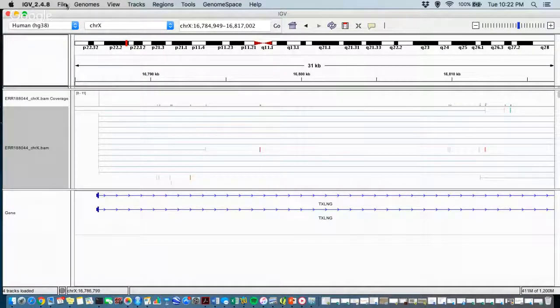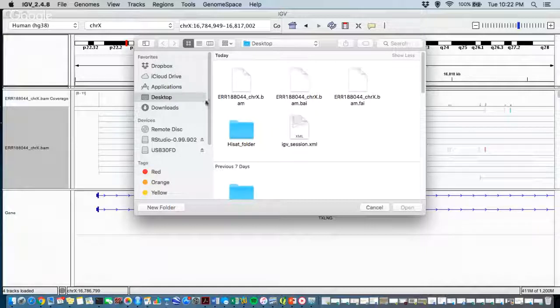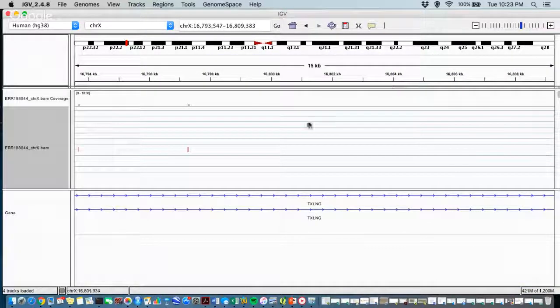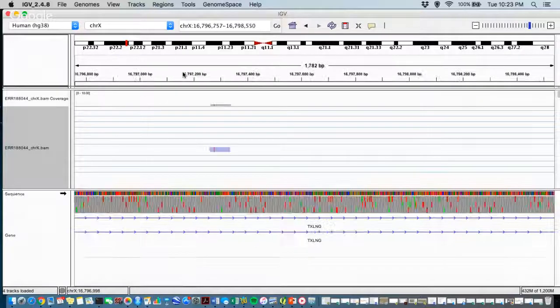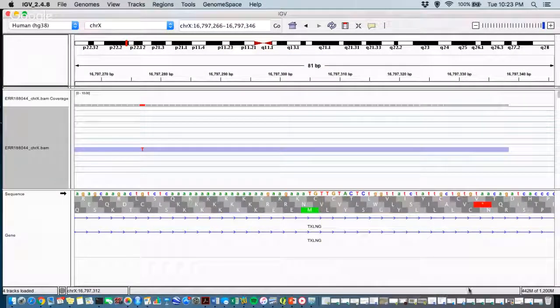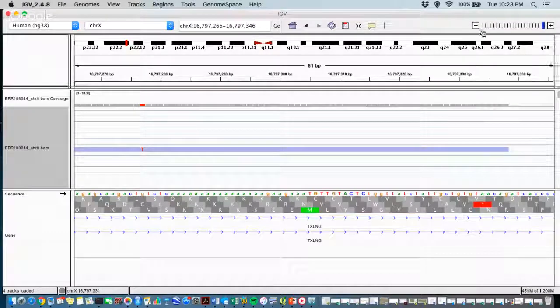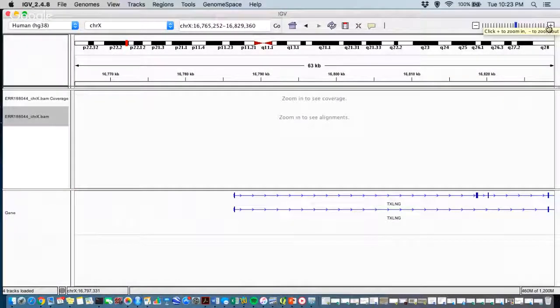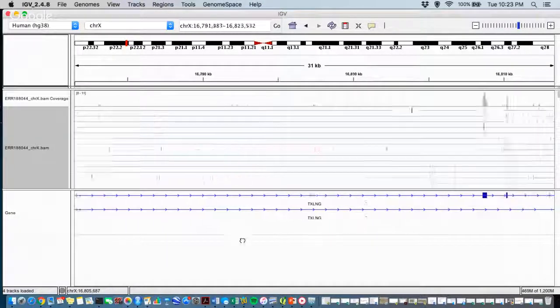In IGV, we load the BAM file and have a reference genome alignment to look at. You can zoom in and out on genomic regions and view the sequence of DNA and amino acid sequences. We only just started playing with the Integrative Genomics Viewer today, so there's still a lot to figure out, but it's pretty cool.